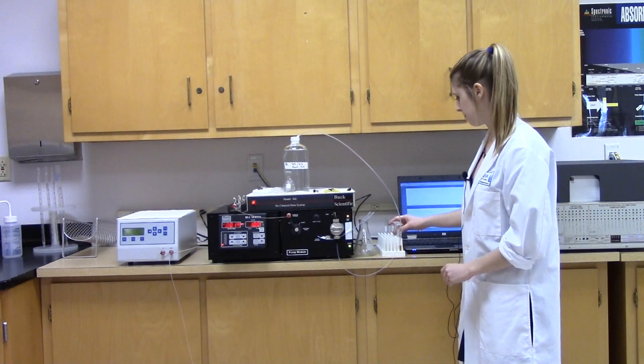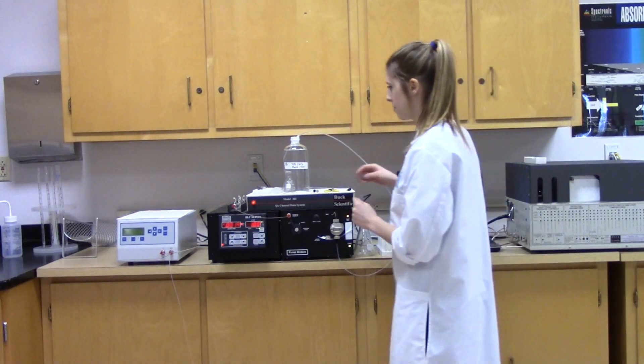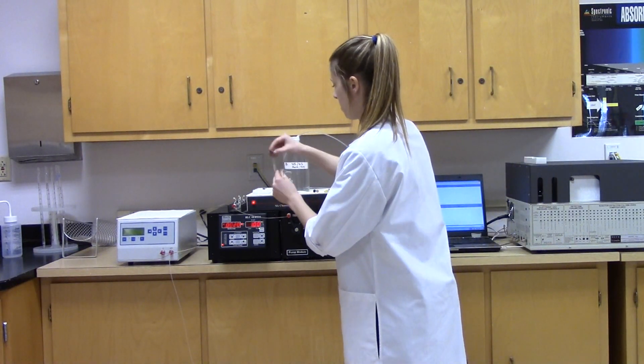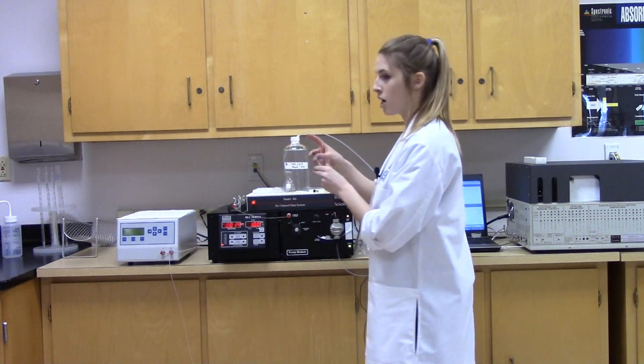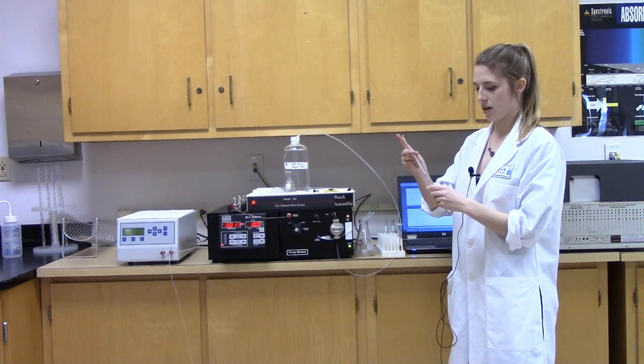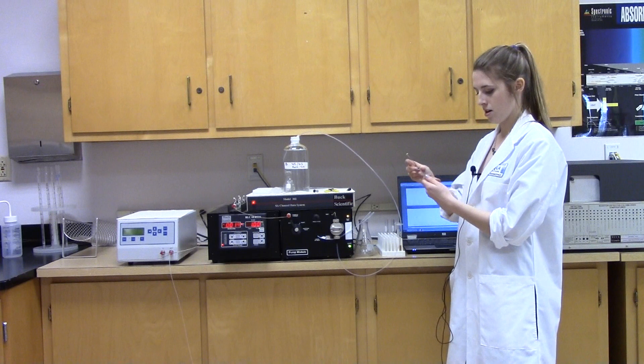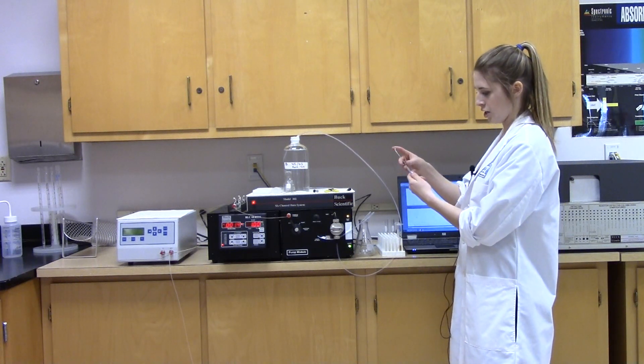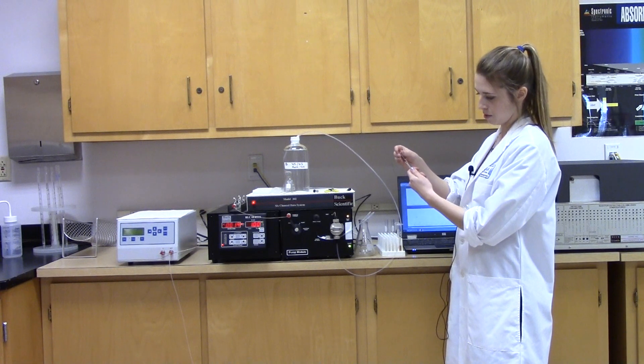So now we're going to inject our pure caffeine into the system. You take the test tube, and you can uncap it. There is a 100 microliter syringe you take. You can put this into the test tube. Try to avoid having it touch the bottom, and you're going to push it out first to release all the air.